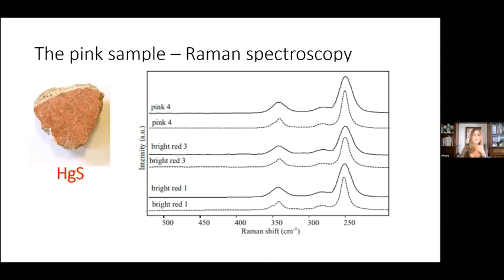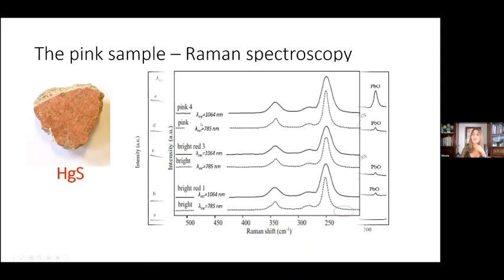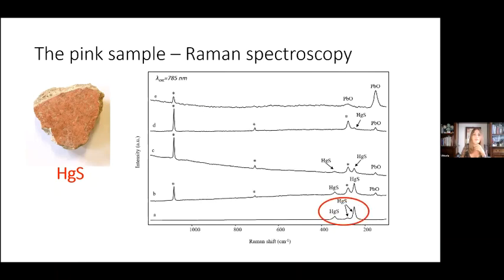The first results obtained by routine Raman investigation were quite surprising because on the basis of previously mentioned SEM EDX outcomes, it was supposed to find at the very least some lead-based substances. Therefore, the sample was also deeply investigated with the micro-Raman device, exploiting its peculiar spatial resolution and therefore being able to perform the measurements on single grains. This made it possible to recognize, besides cinnabar and calcite, also lead oxide PbO in its tetragonal form known as litharge, that is red.